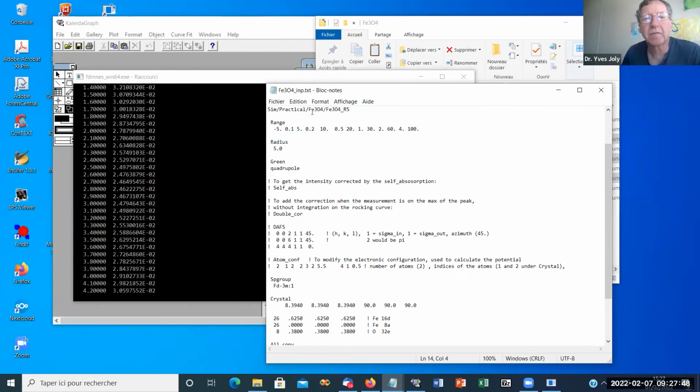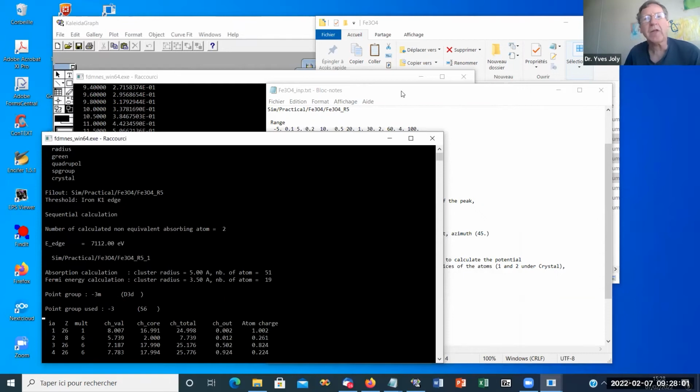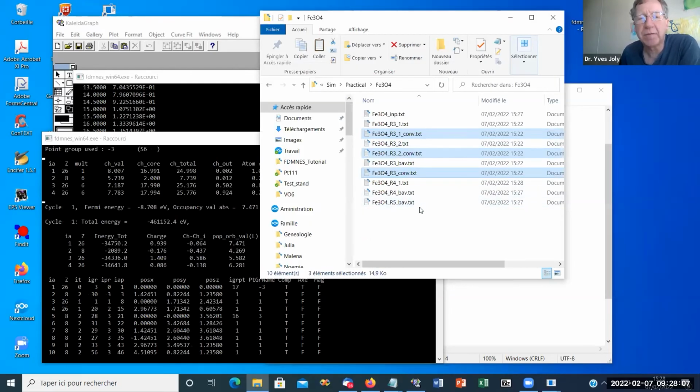So I immediately calculate. You can see it's a bit longer. So I have saved time. I can send another job at the same time. It's not a problem. Okay. Now, maybe, so it's running.